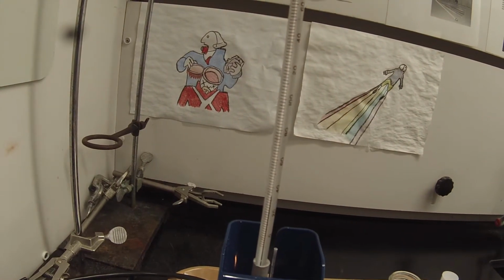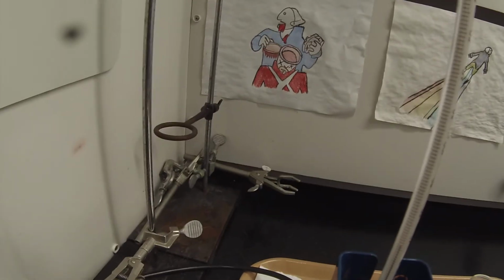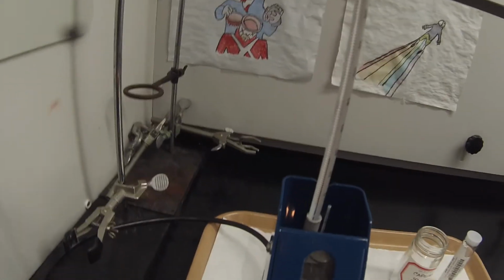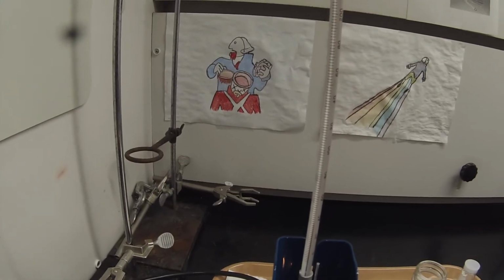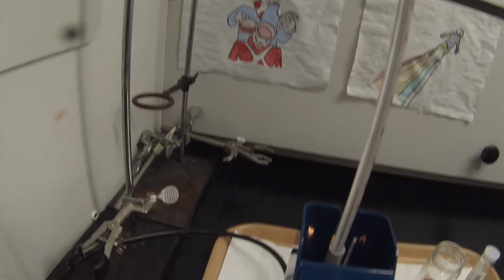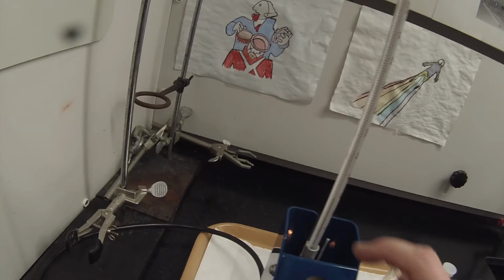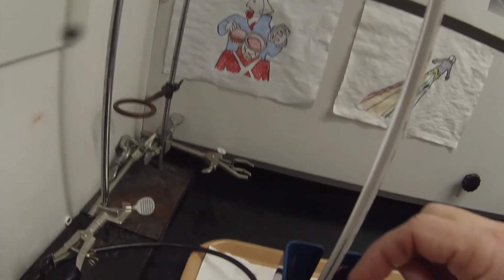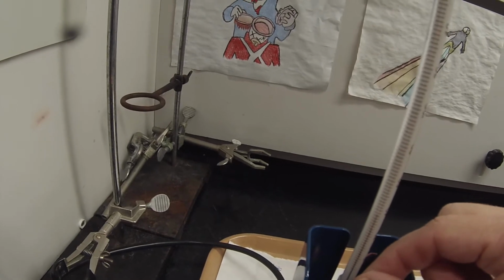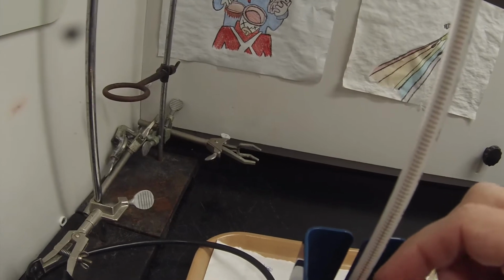We're up about 32 degrees so far. So, rising fairly slowly. I expect I'll have to turn this up to somewhere around 6 probably by the end, but I don't want it to go too quickly and miss that melting point. Give that a little tap actually. See if I can get that in there a little more uniformly.